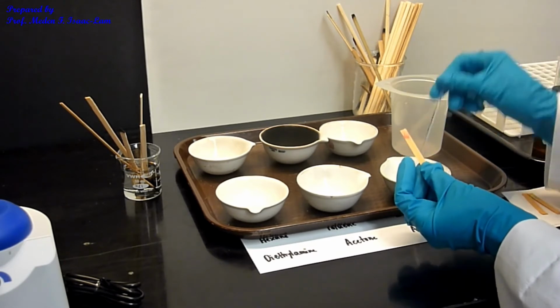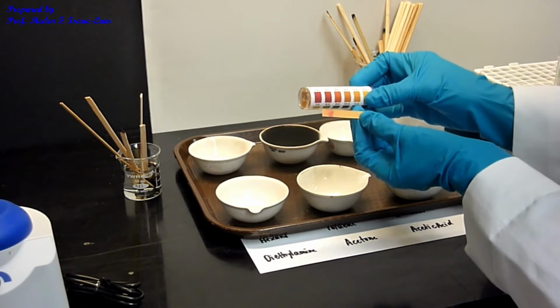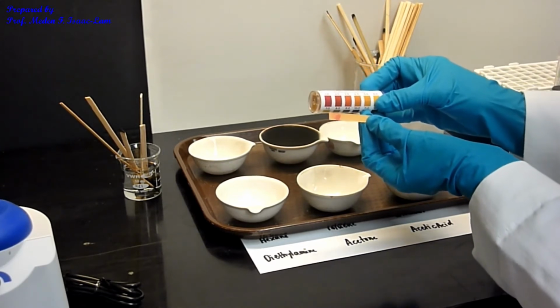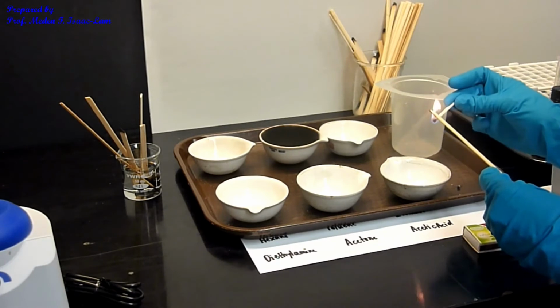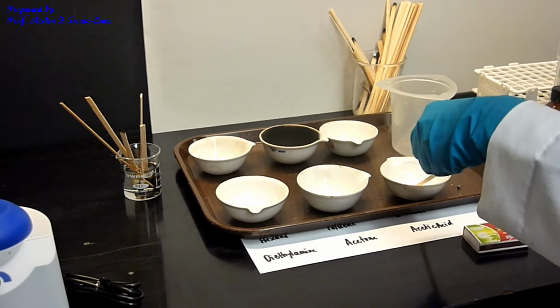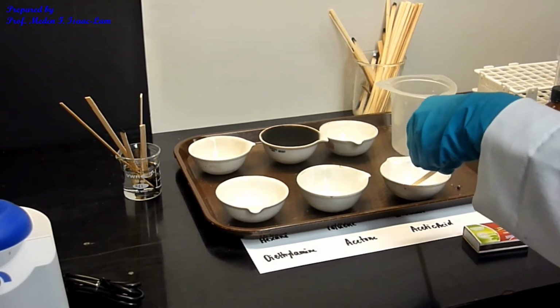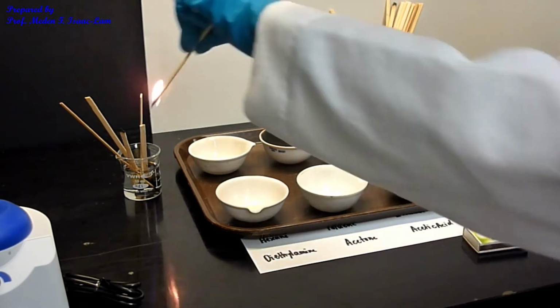Okay, so the color is now around 2. Okay, so all right, now we're gonna do the last one of the samples. I guess I can use the match, but okay, so it's not combustible. All right, nothing.